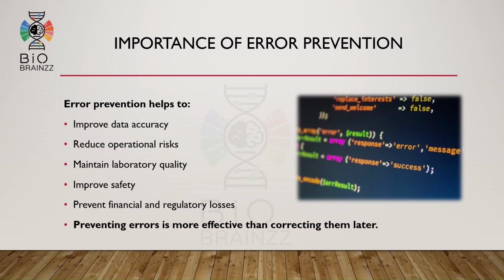Error prevention is extremely important in laboratories because it improves data accuracy and reduces operational risk. It helps maintain laboratory quality and improves workplace safety. Proper error prevention also prevents financial losses and regulatory issues. Preventing errors is always more effective and less costly than correcting them later.